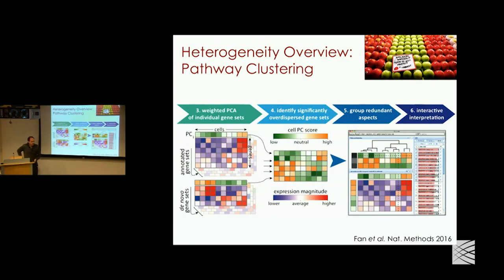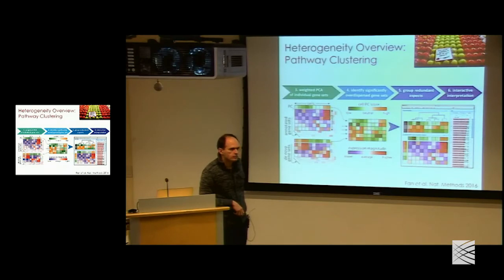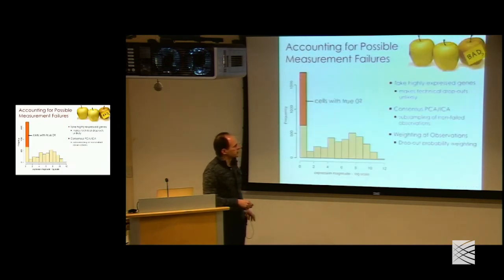So many times there are cases in the data where you do have a few very distinct clusters, right? And then you want to drill down into each of these and find the substructures. So would the way to use this method be to rerun this on a limited number of cells, or to use more principal components? Well, no. We basically advocate rerunning this. In the paper, there was a little loop going back. And the reason is this variance normalization.